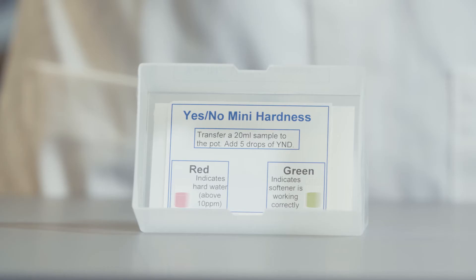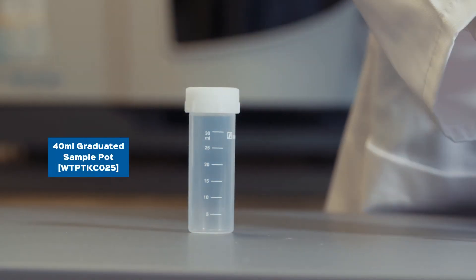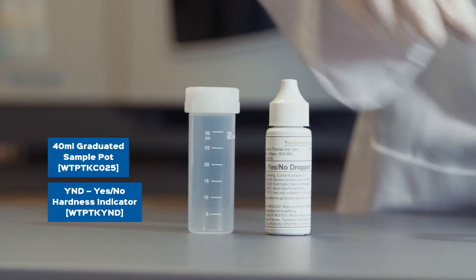The kit consists of a 40 milliliter graduated sample pot and yes no hardness indicator.